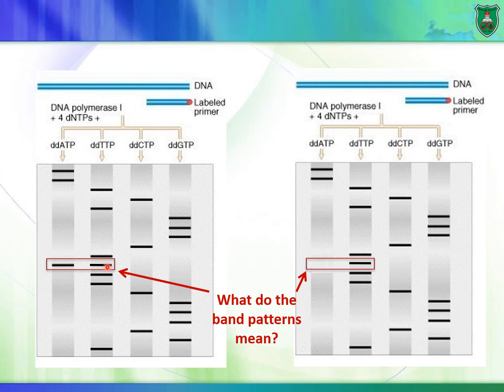So the DNA polymerase would read both DNA fragments, adding T here and adding A on the other one, and it would continue with the same exact sequence because there's only variation in one nucleotide. So we're going to have DNA fragments having the same length in here. So we know that there is polymorphism. Or it can be a mutation, by the way. It can be a mutation in one of the alleles, mother's or father's.